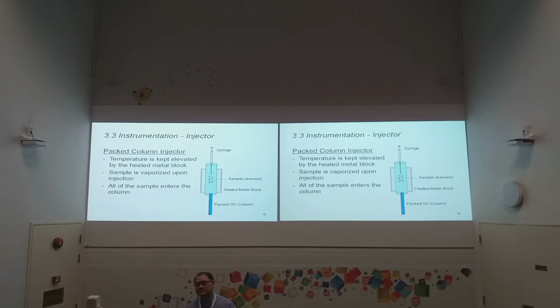So then the mobile phase in the GC technique, gas chromatography, comes in. The mobile phase can easily carry or bring those so-called products, or so-called analytes, into the instrument, into the column. So that is the design thinking, the design behind all these instrument components.